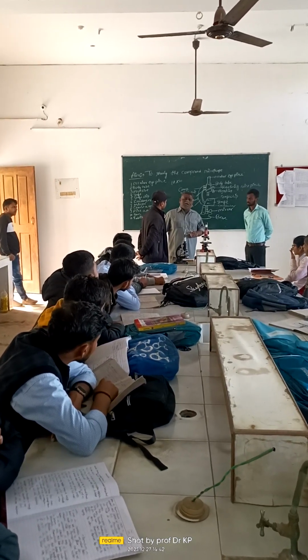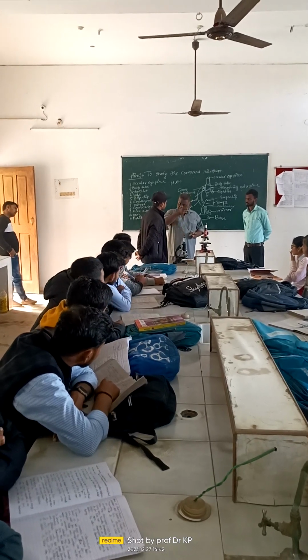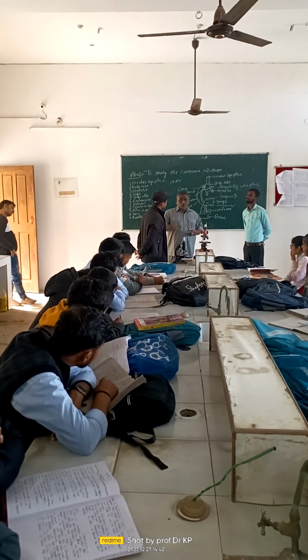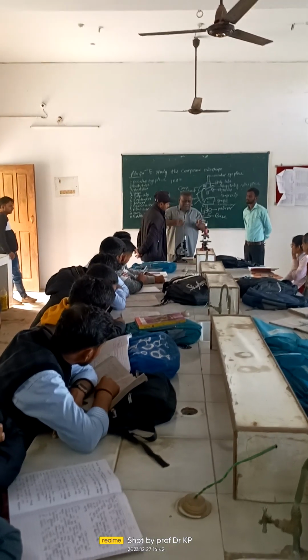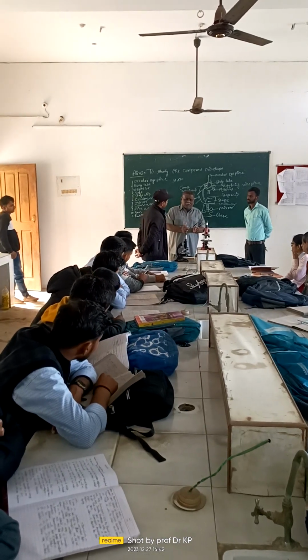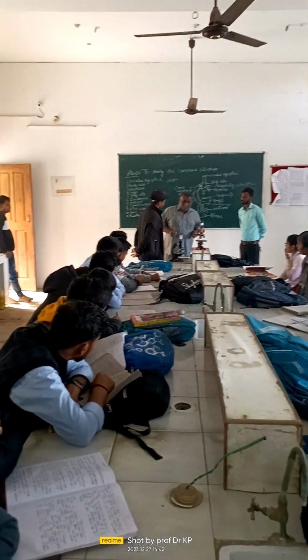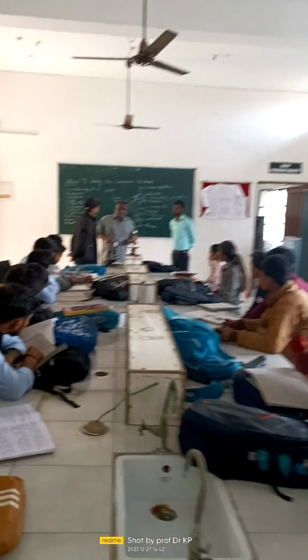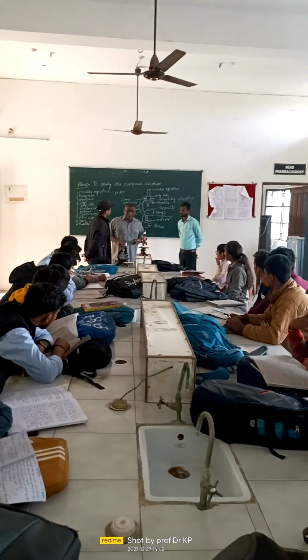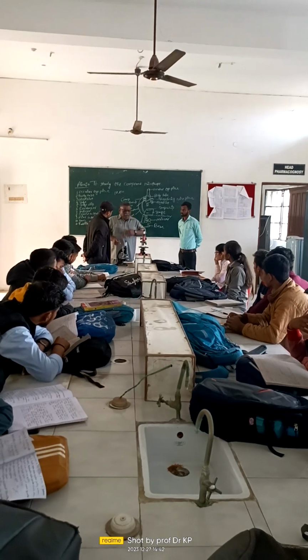With the help of two lenses, one is called as objective lens, other one is called as eyepiece lens, you will be magnifying the particular object or the particle or the material to be studied. It will be enlarged, and you will be able to see the particle under the microscope, and you can study the features. Clear?